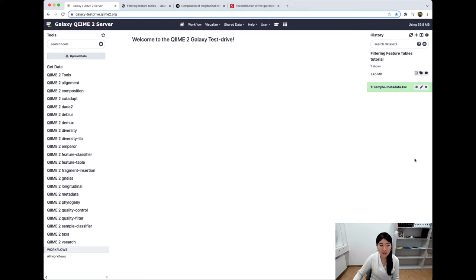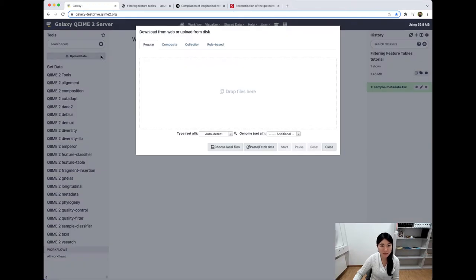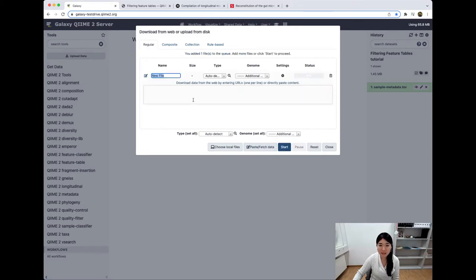For the sake of this tutorial, I've kept just the sample metadata TSV, which will come in handy later. Now, we're going to upload two data files for this tutorial. Let's start by heading to upload data at this button right here. We'll keep this tab at regular and go to this paste and fetch data button.